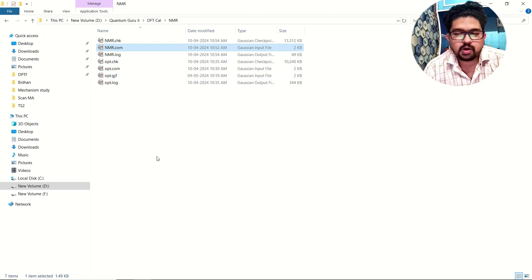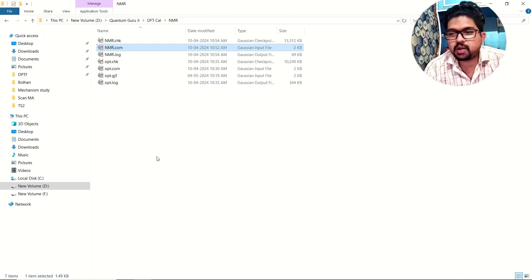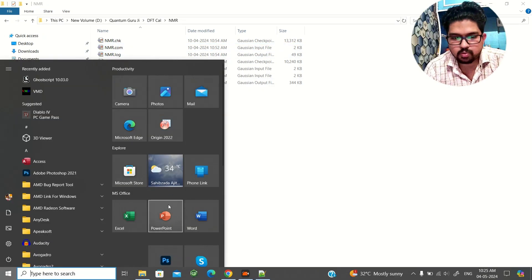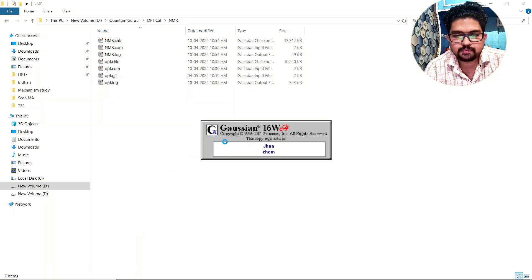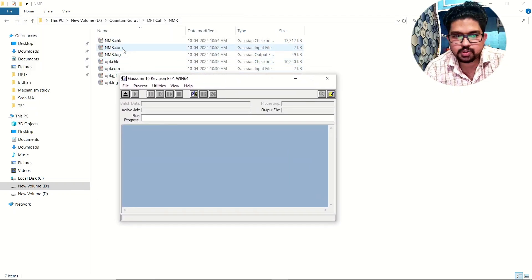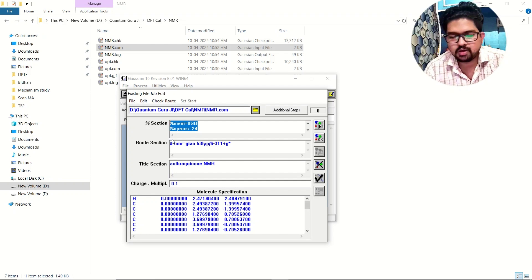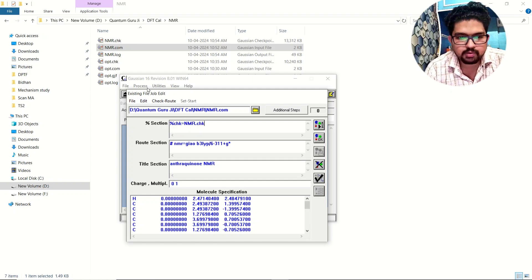Once the input is ready, you can run your Gaussian calculation. If you are using a cluster, I will make a separate video on how to submit a calculation on an HPC using a script file. If you are using a normal desktop or laptop, open Gaussian, drag your input file in, go to the file menu and select Modify. You don't need to specify processors and RAM in the input file if you pre-fix them in Gaussian preferences.